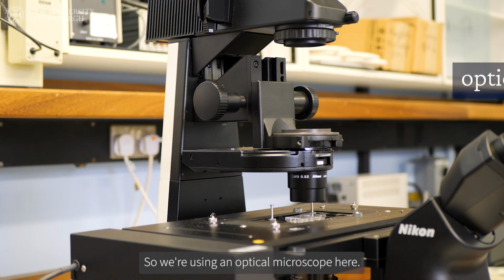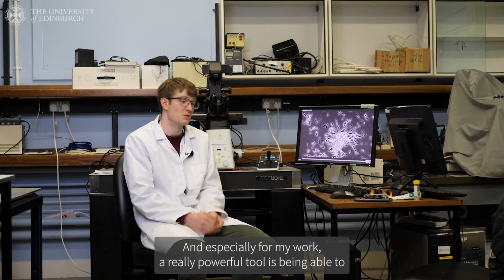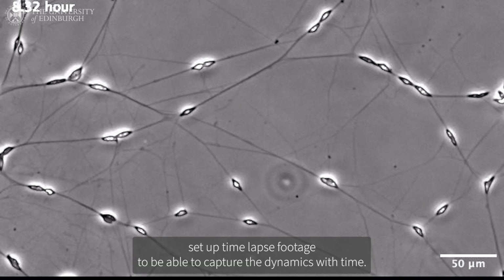So we're using an optical microscope here. It's really versatile, so we can have various different magnifications to study behavior on different length scales. And especially for my work, a really powerful tool is being able to set up time-lapse footage to be able to capture the dynamics with time.